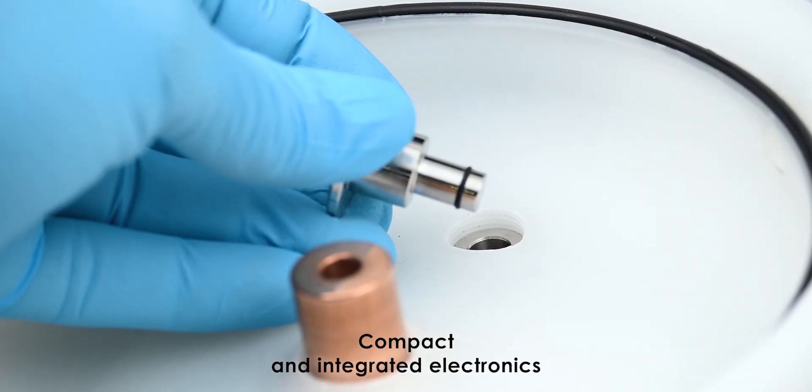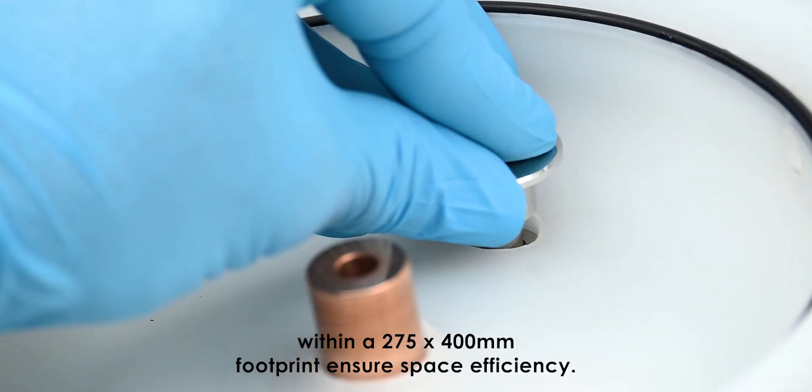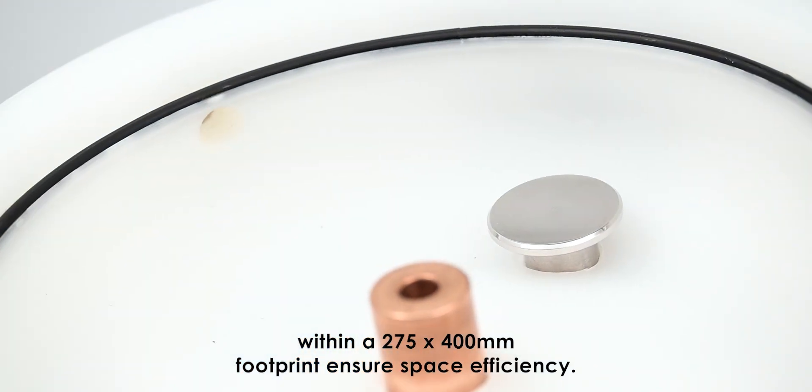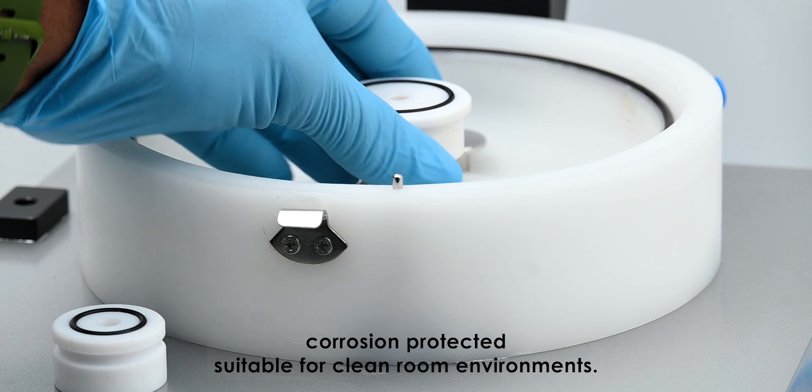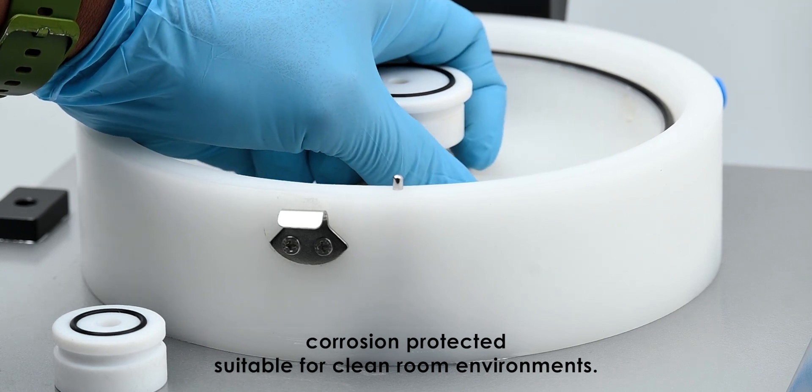Compact and integrated electronics within a 275 by 400 millimeter footprint ensure space efficiency. All components are corrosion protected, suitable for clean room environments.